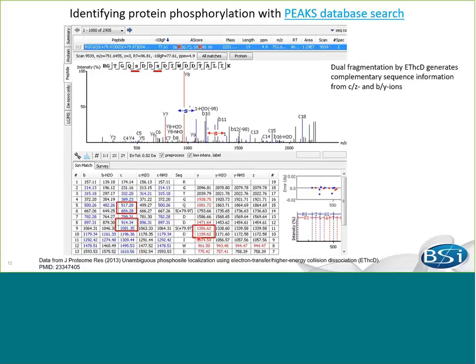Although the enrichment step can facilitate the identification of modified peptides, there are always cases where an enrichment method is not available yet, and low-abundant peptides bearing PTMs are present in a complex peptide background. So how does PEAKS perform under those difficult conditions? Can we still identify these PTMs with high sensitivity?